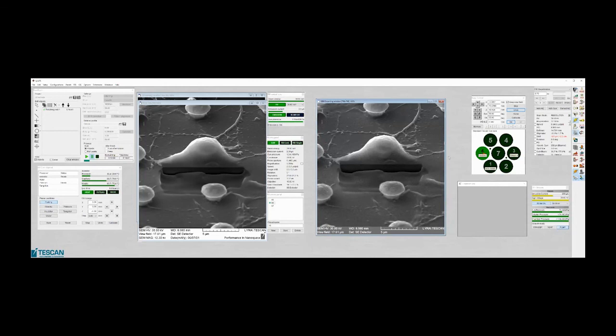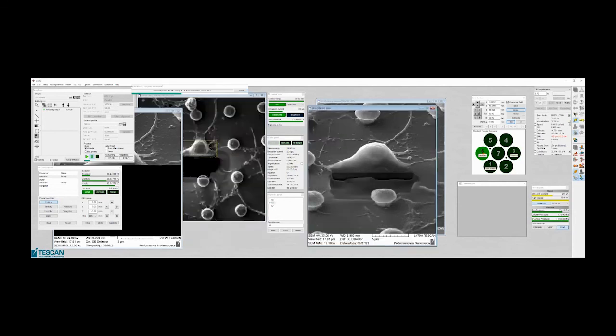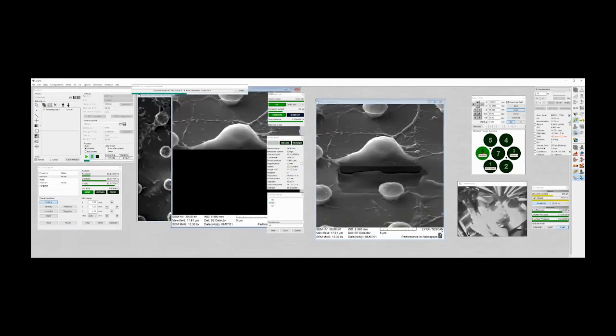Okay, now we really see the difference. So it was the first one.